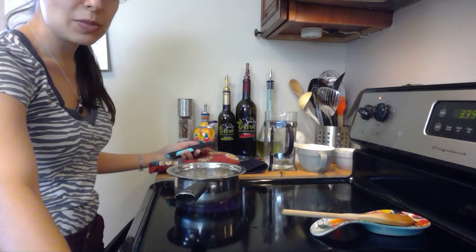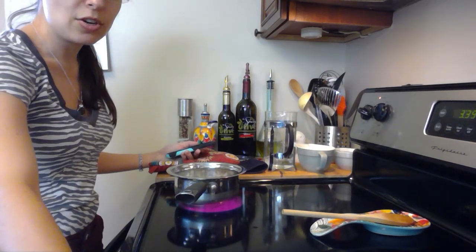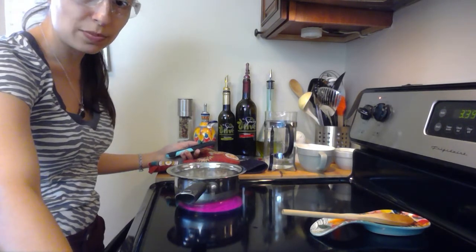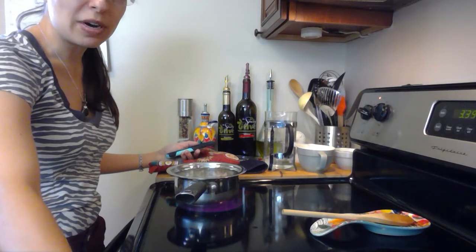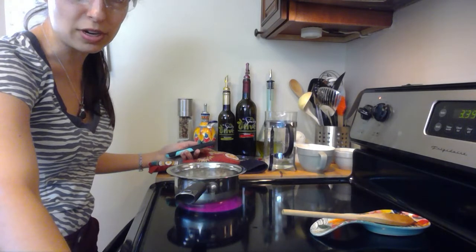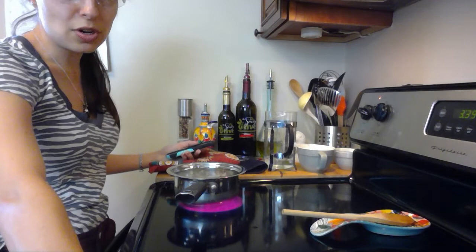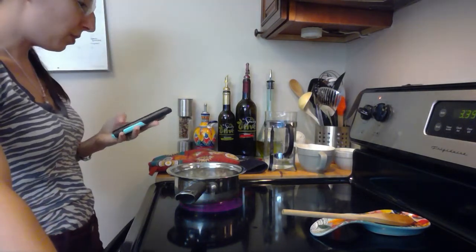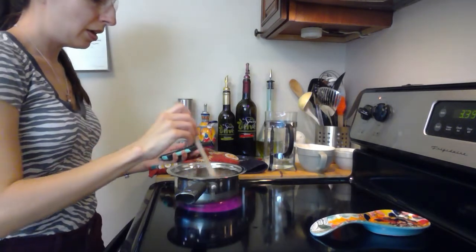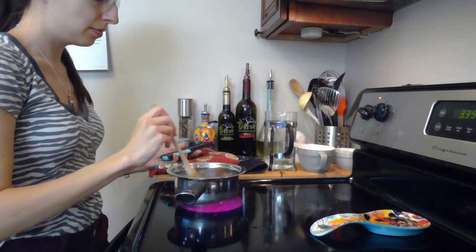Now the length of your experiment might vary a little bit, but you want to make sure that you're getting as much data as you need to get your water to be at a boiling stage. Not just the start of a boil, but a nice solid boil for a minute or 2 before you end your temperature recordings. So your procedure says about every 2 minutes you want to take the temperature until it's at a full boil and you've completed your table. So I'm nearing my 2-minute mark. I'm going to go ahead and stir.